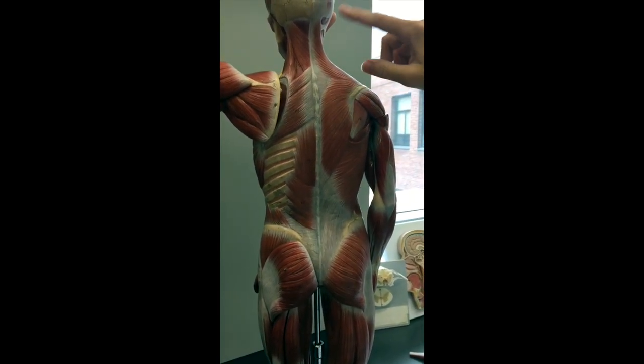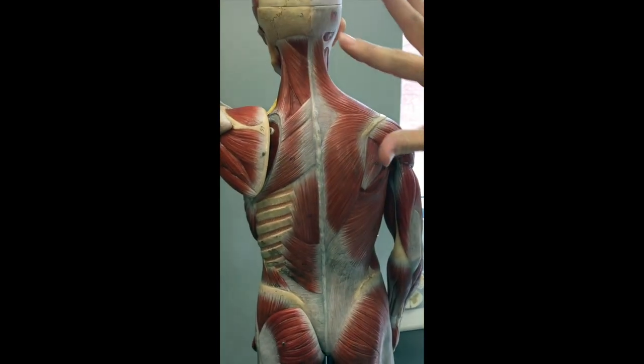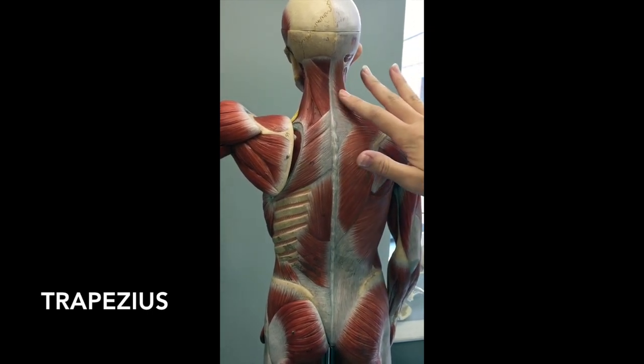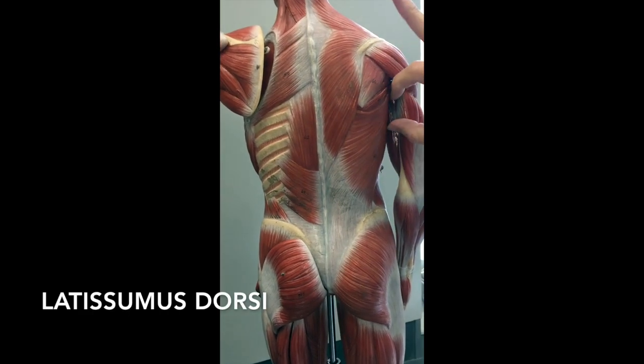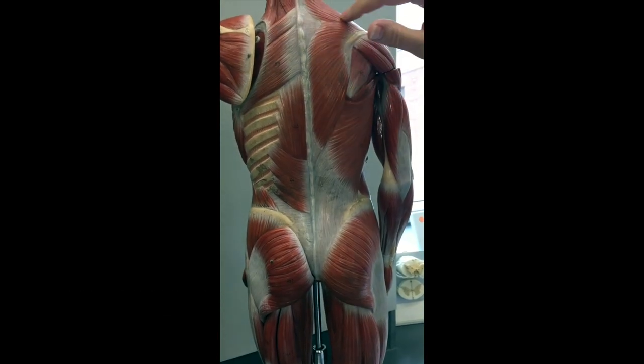So the muscles: this muscle that starts way up here, wraps down, goes all the way down like a big huge triangle — that's trapezius. The bigger one on the lower part of the back that wraps all the way around and down is going to be your latissimus dorsi. So this huge one here is latissimus dorsi, and trapezius is here.